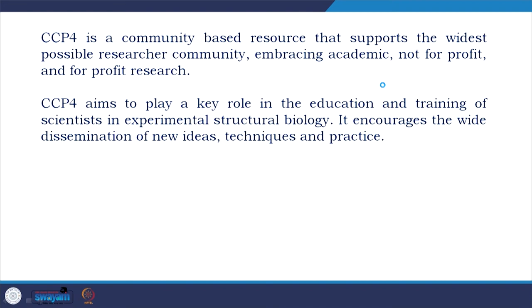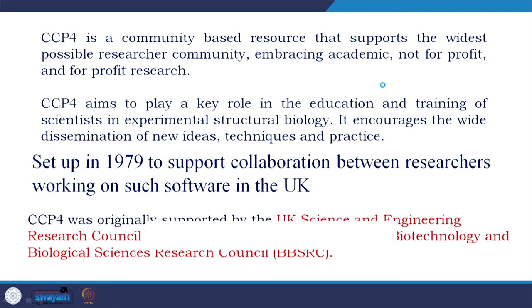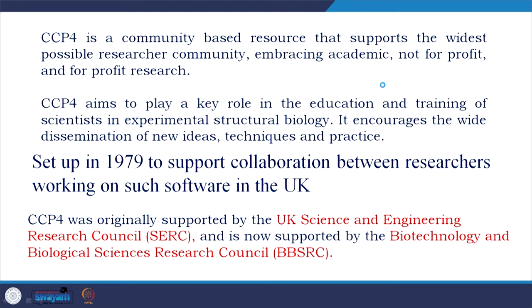CCP4 aims to play a key role in the education and training of scientists in experimental structural biology. It encourages the wide dissemination of new ideas, techniques, and practice. When I am going through the crystallographic part, especially the software, a lot of these I have also taken from different CCP4 training modules. So, worldwide researchers have taken their presentations, their academic materials, their software, and we, as a scientific community, are indebted to them. Set up in 1979 to support collaboration between researchers working on such software in the United Kingdom, CCP4 was originally supported by the UK Science and Engineering Research Council, which is SERC, and is now supported by the Biotechnology and Biological Sciences Research Council, which is BBSRC.